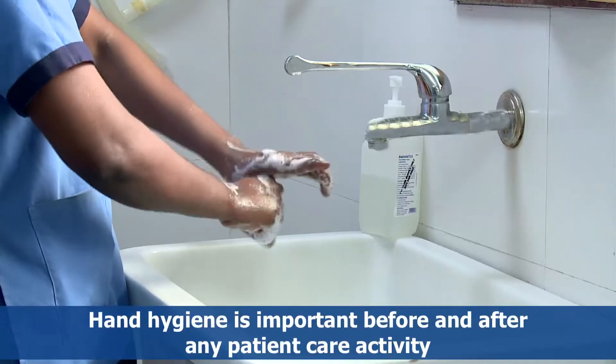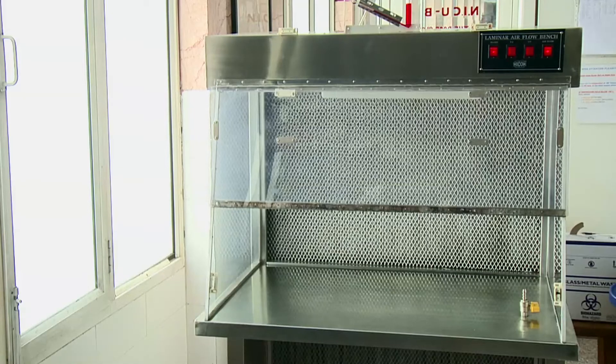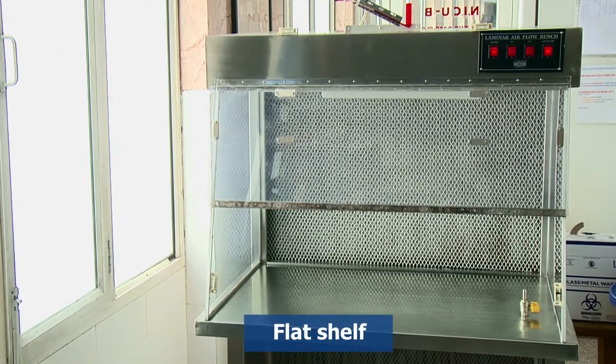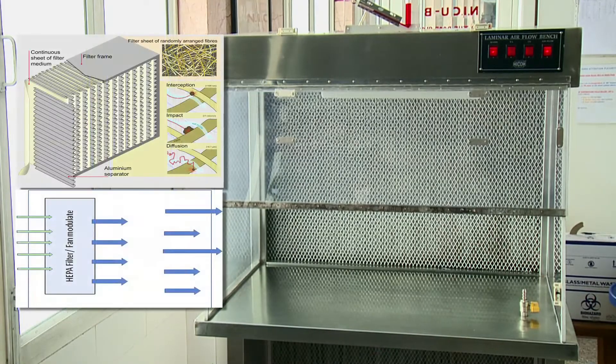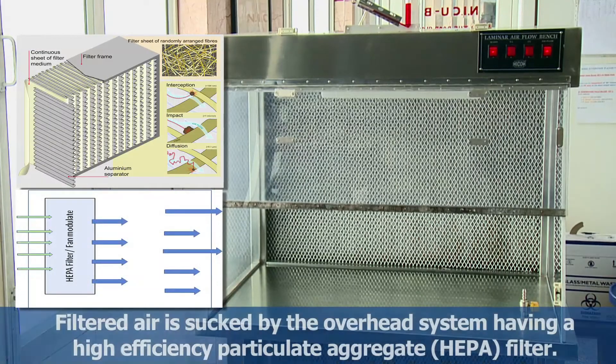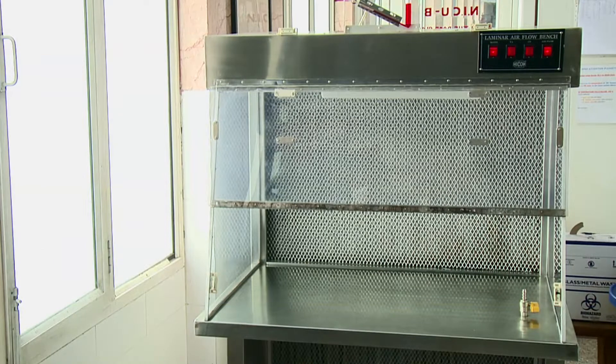In this video we shall demonstrate the use of laminar flow. The laminar flow is a workstation with a flat shelf to work on, onto which a unidirectional flow of filtered air is sucked by the overhead system having a high efficiency particulate air, that is HEPA filter. It is used to maintain asepsis while preparing medications and parenteral nutrition.